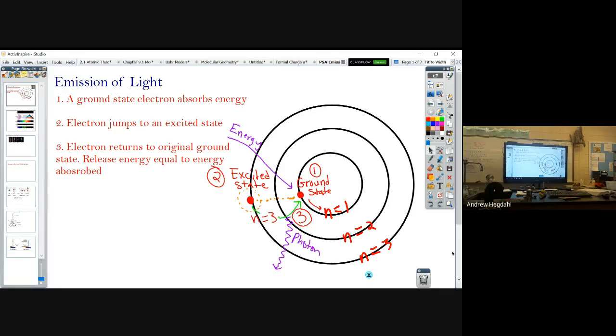And so today what we're doing is a flame test lab, and we're replicating an experiment done by a famous scientist, Niels Bohr, where he was able to determine, based off his observations, that there's a unique structure about the atom, okay? And so last week, we started drawing Bohr models, and this kind of represents a Bohr model, too. And so what he found is that when he burned different elements in a flame, that they each gave off their own different colors of light. Okay.